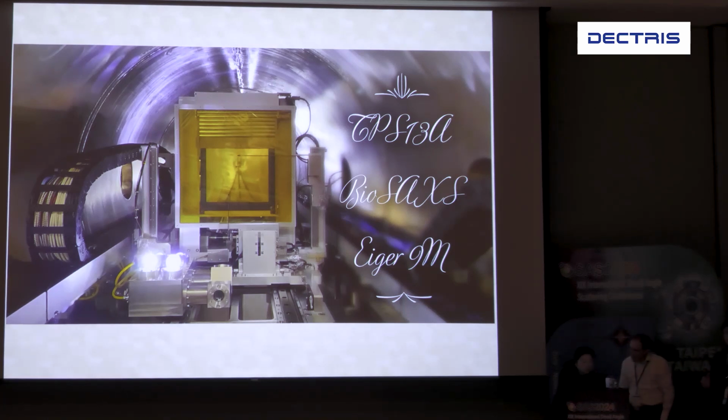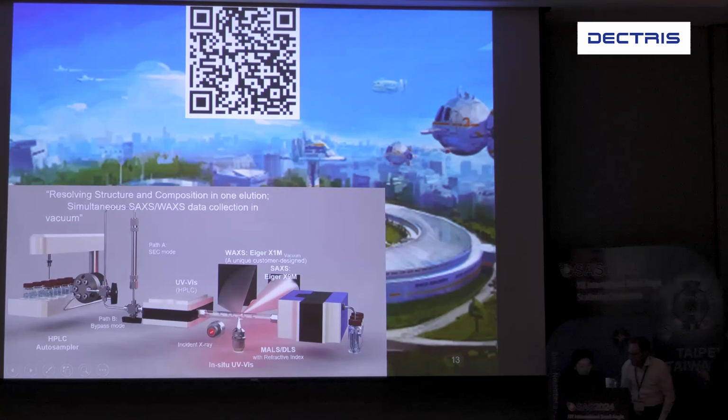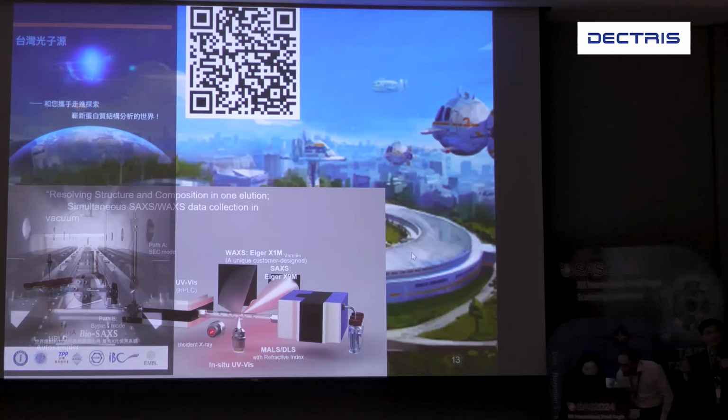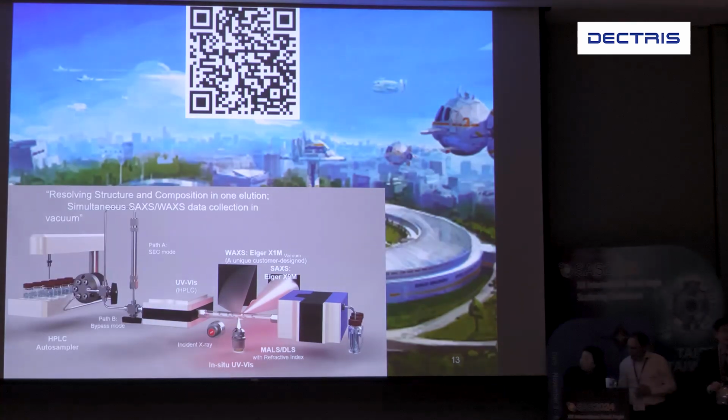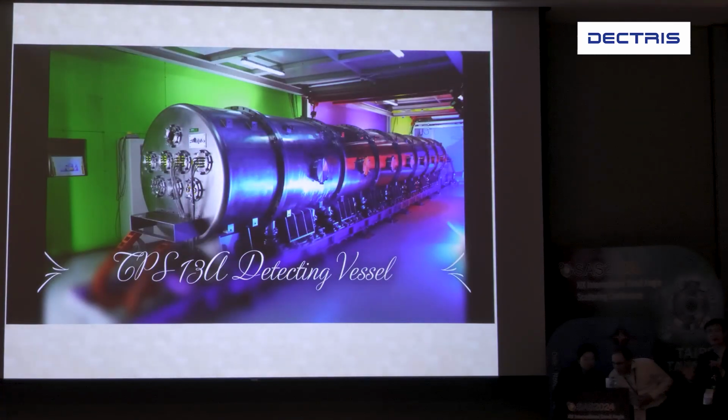But this is just hardware. If you want to make it really work, you need software to combine the two detectors' data in one data processing. And we have also accomplished this. So when users operate this detector system, all the data processing is in one protocol under one window. You automatically get SAXS and WAXS data merged and background subtracted, and then come up with the data sets I showed you. So users just feel like they are operating one detector and doing one data reduction. No complicated merging process.